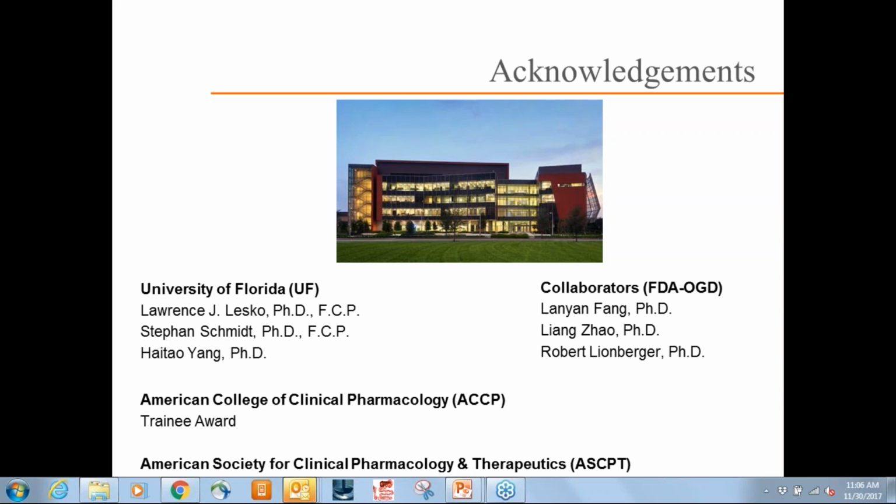Now, when you bring those in vitro profiles over to GastroPlus, you could actually add variability to those high and low profiles if you want. But I think the goal there is that we already are picking out the extremes of what we expect the dissolution variability to be. So I don't think you need to add more variability on top of that. Once you bring it into the population simulator, you can just simply use the variability of the subjects in the population simulator to dictate what your in vivo variability is. But yeah, those are interesting, good questions.